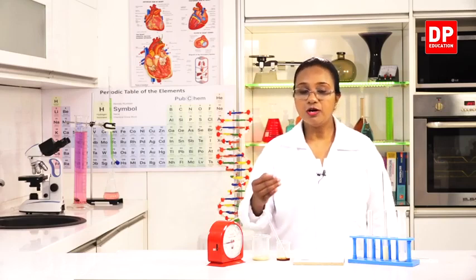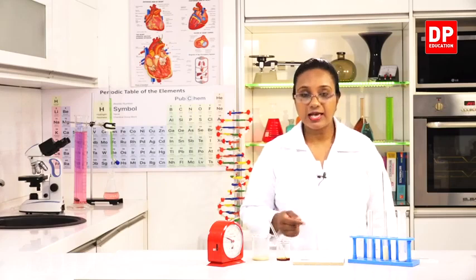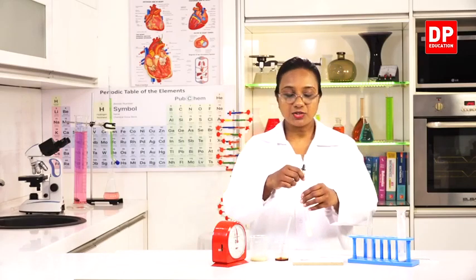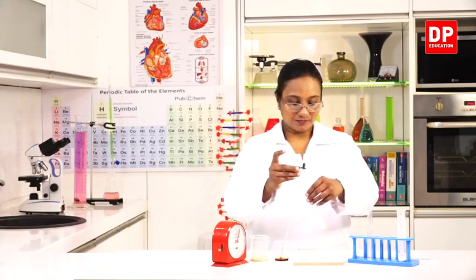So until then, we will have to draw samples from the mixture every 2 minutes and test it with iodine. Now we have waited for 20 minutes. Again, we'll test with another drop of the mixture.